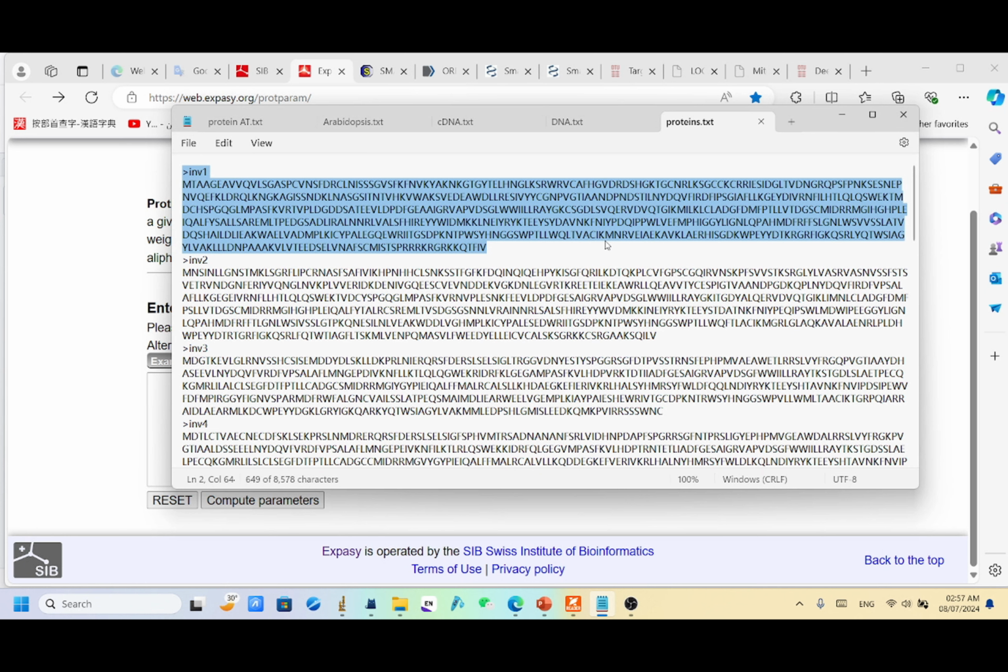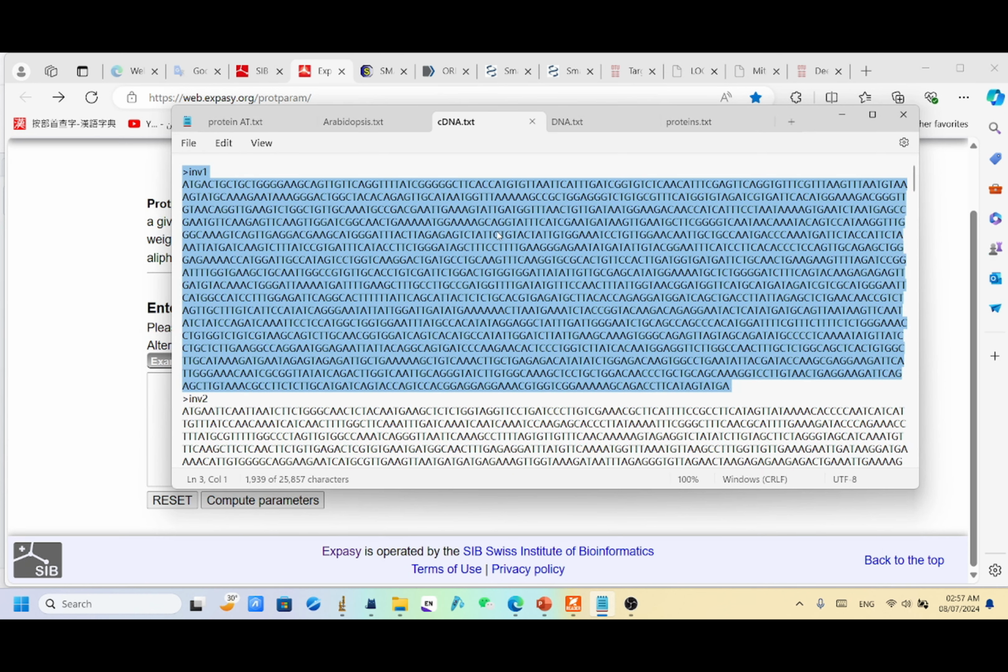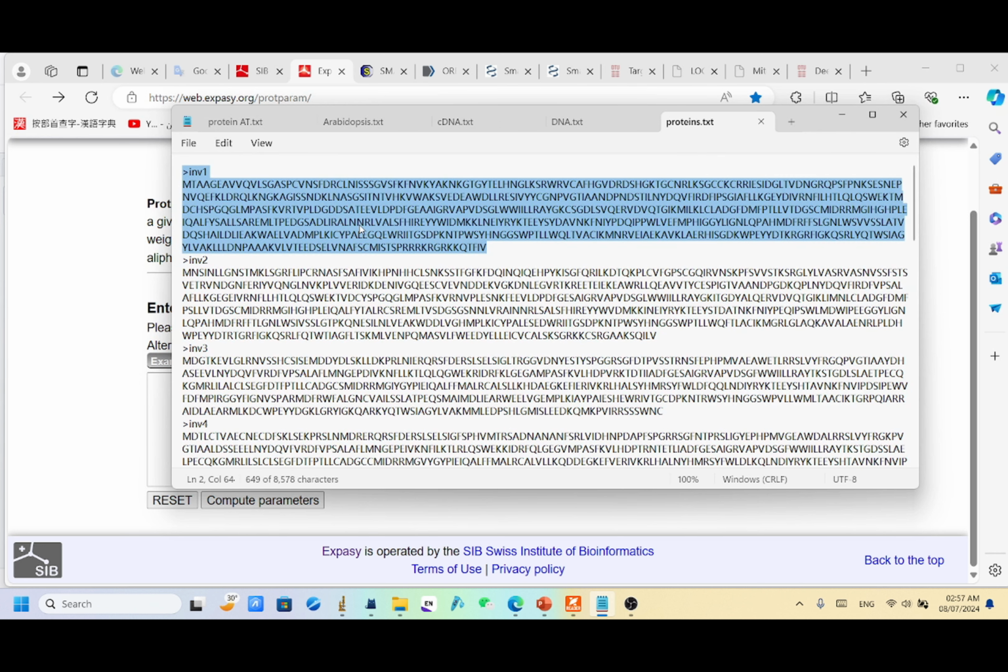So after checking that our sequences have the same conserved domain, and that they also encode an ORF, next we will obtain some biochemical properties like molecular weight and isoelectric point. How can we do it?